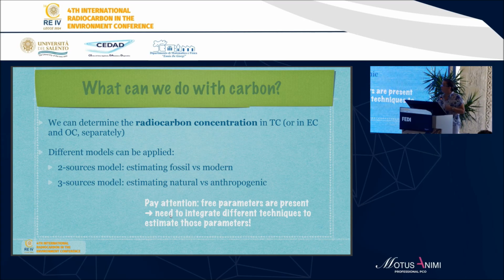But now I will focus on radiocarbon, and what we can say is that we have to do some source apportionment for radiocarbon. We can either measure the total carbon or the EC and OC separately.